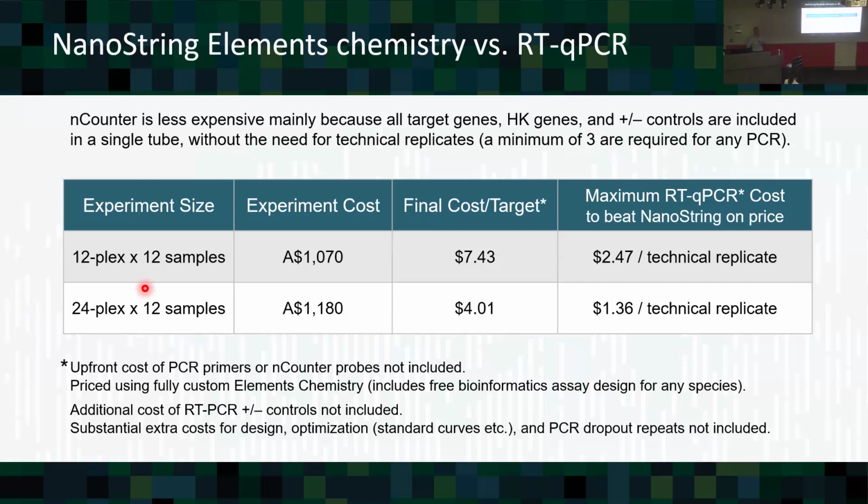If you are in discovery mode, you really have to go RNA-seq and you can get pretty good results. I'm not going to say you can't work with RNA-seq, you can. You just have to do the usual validations. When I gave you all those scary stories, that's not the end of the story. It doesn't mean it doesn't work, but a lot of people make stupid mistakes and publish things which should be retracted or binned. You don't do that.